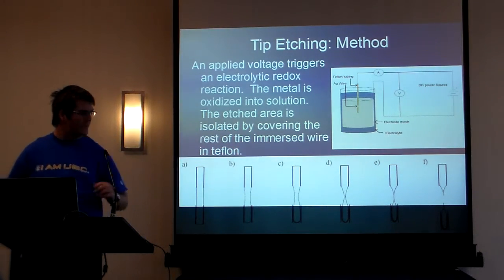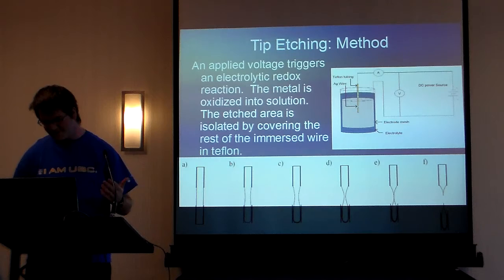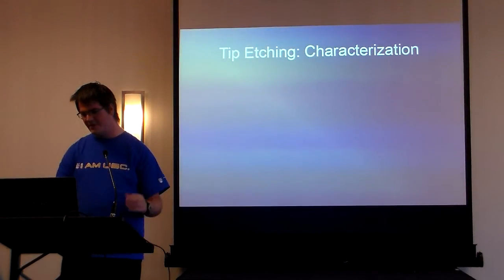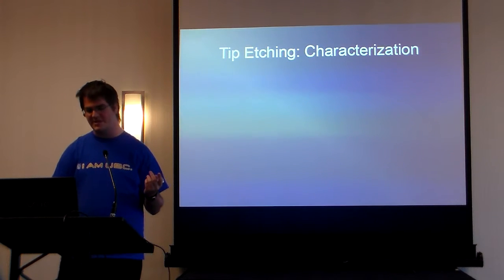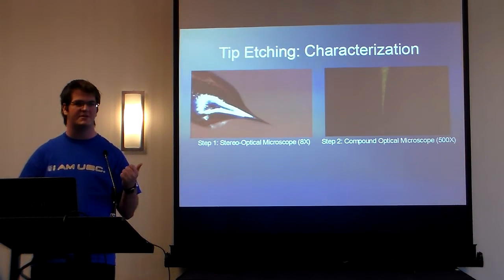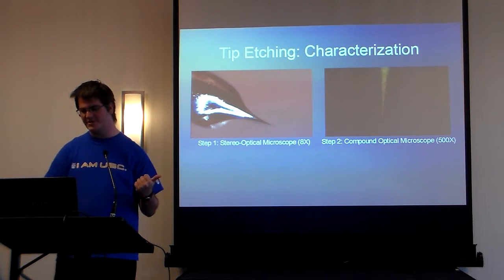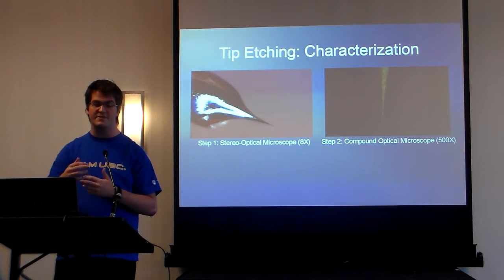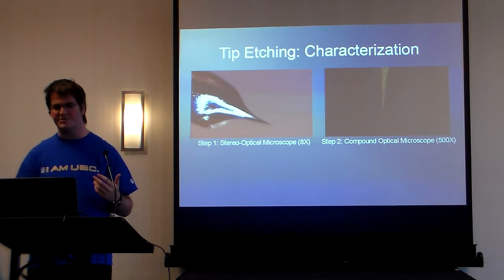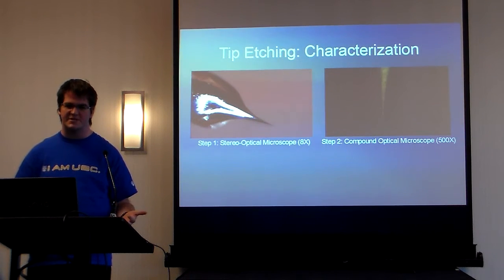It's kind of dark there. But it's a very, very simple system to use. And so in order to characterize these tips, I used a step-by-step process. The first two steps were both optical microscopes. There's an 8x stereo microscope, which is very good with depth of field, an amazing depth of field. And then the compound optical microscope has much more zoom, but not quite as good depth of field.